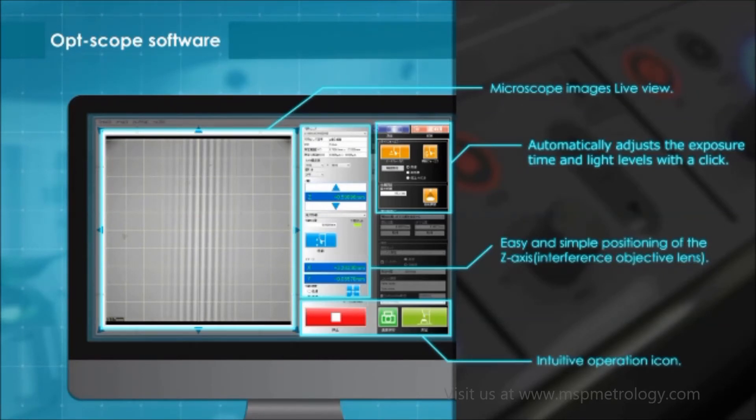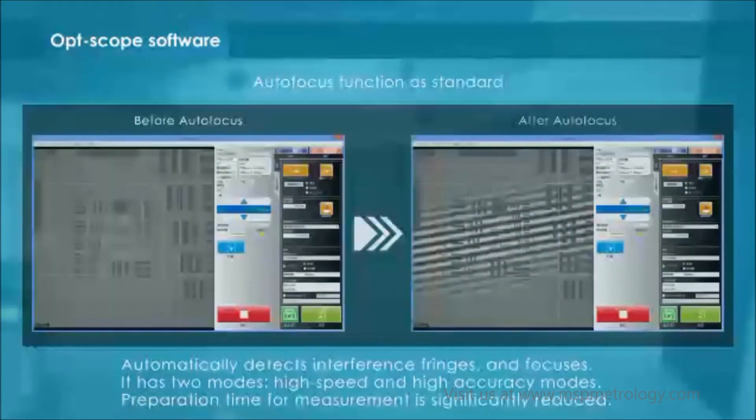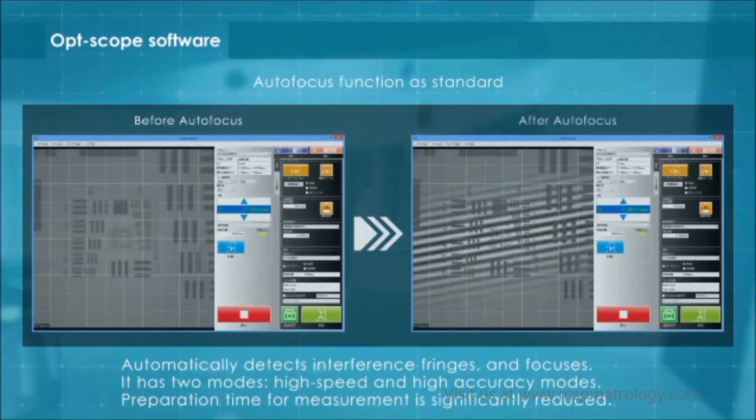For a more intuitive interface, the image displaying area and buttons are large in size. This Optscope software comes standard with an autofocus function, which automatically detects interference fringes and focuses. It has two modes: high-speed and high-accuracy modes. Preparation time for measurement is significantly reduced.